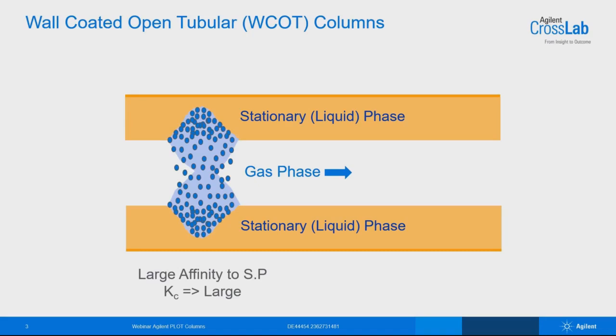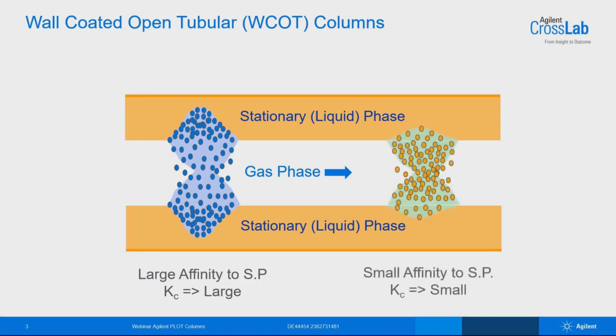Now, the difficulty of using liquid phases for the separation of gaseous solutes is that they are so volatile, they prefer the mobile phase over the liquid phase. As a result, the partitioning coefficient is low, the compound retention is minimal, and therefore the separation is incomplete. Or in cases there's no separation at all. Let me show you an example.